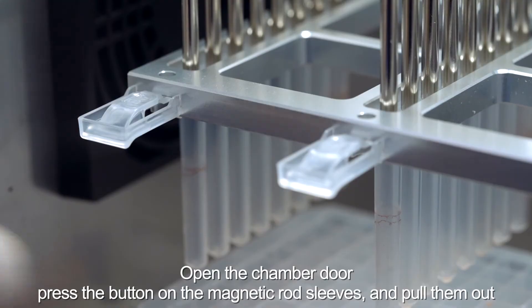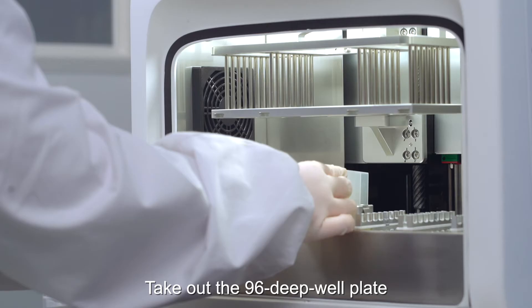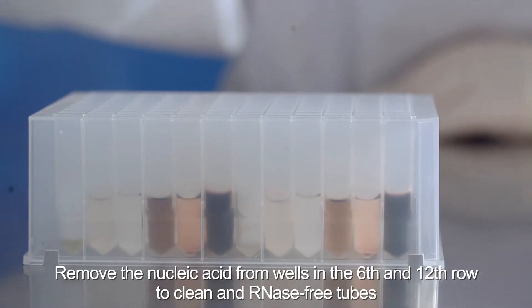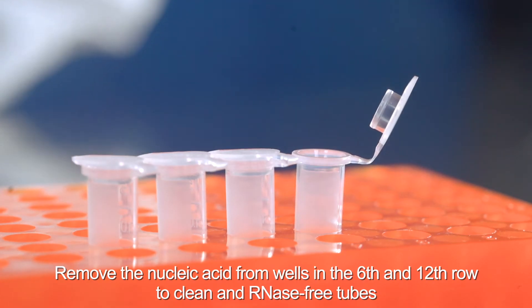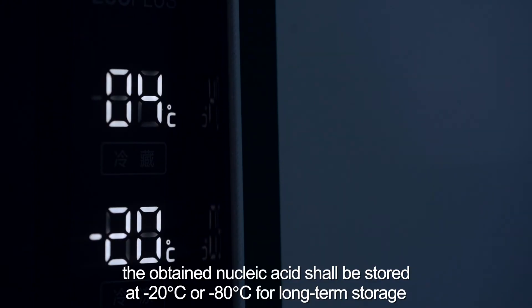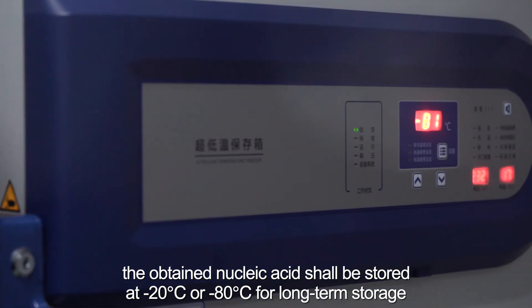Open the chamber door, press the button on the magnetic rod sleeves and pull them out. Take out the 96 deep well plate. Remove the nucleic acid from wells in the sixth and twelfth rows to clean, RNase-free tubes. If not being used immediately, the obtained nucleic acid should be stored at minus 20 degrees or minus 80 degrees for long-term storage.